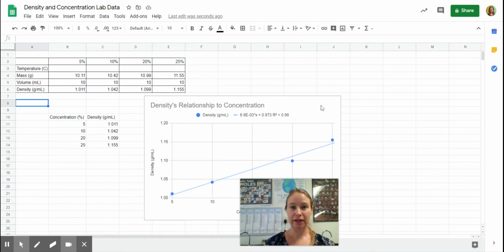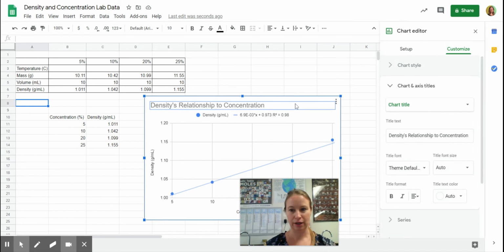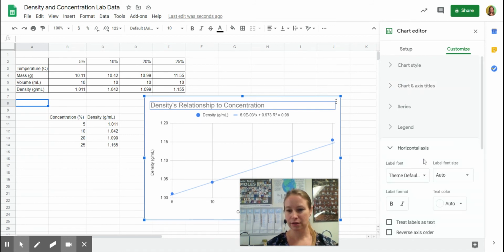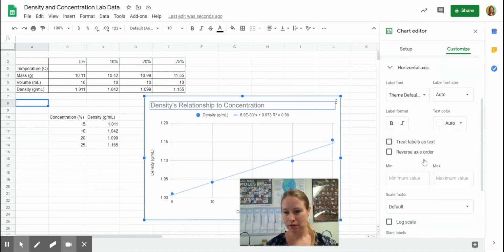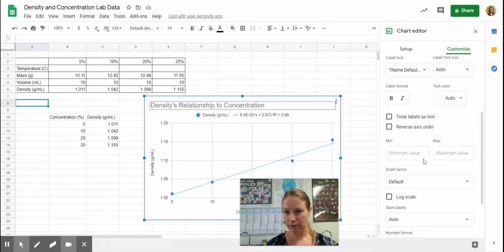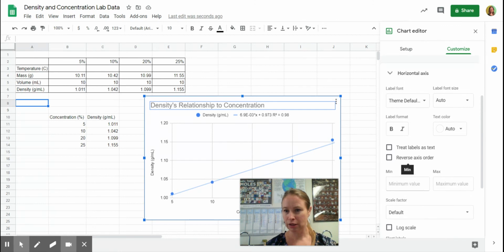In order to find the identity of our unknown solutions here, we're going to need either this equation or we're going to need some more grid lines in here. So I'm going to double click my graph, and I need, in the horizontal axis, log scale, where's the minor?